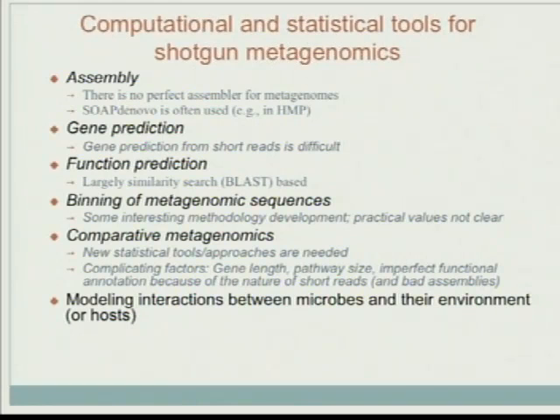because, as I said, there are many similar species in the same sample. So they're just like repeats, and they really confuse assemblers. And also because of the abundance difference. Some genomes are very abundant and some species are of very low abundance. So it's very hard to distinguish whether those are repeats or they're from highly abundant species.